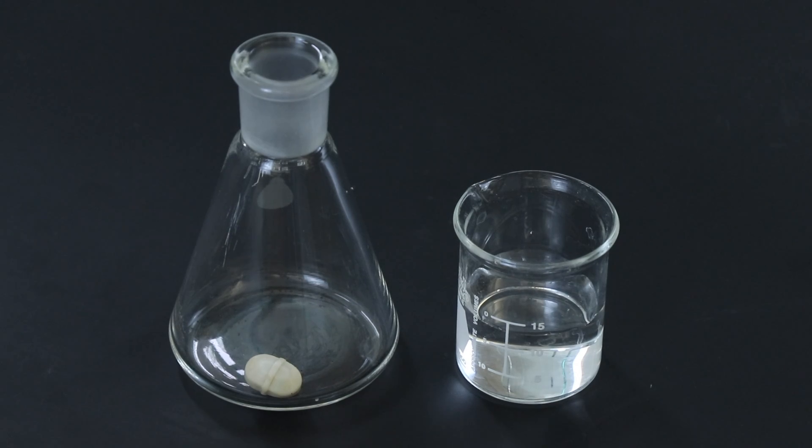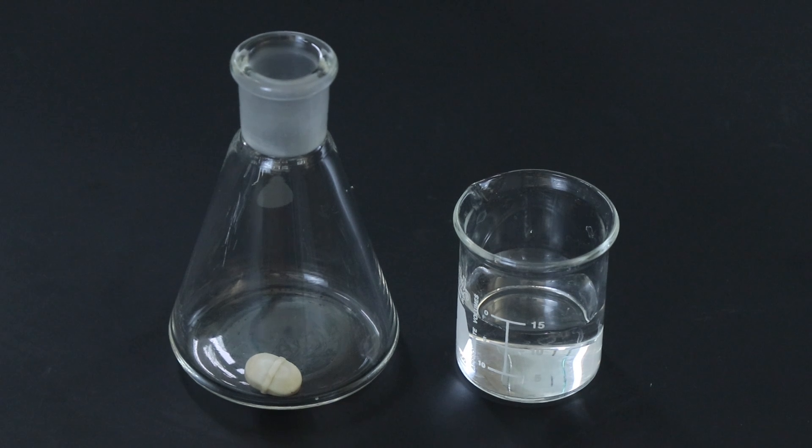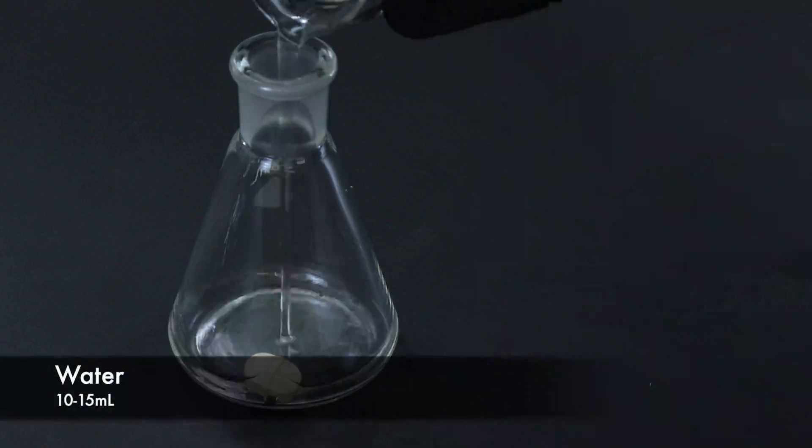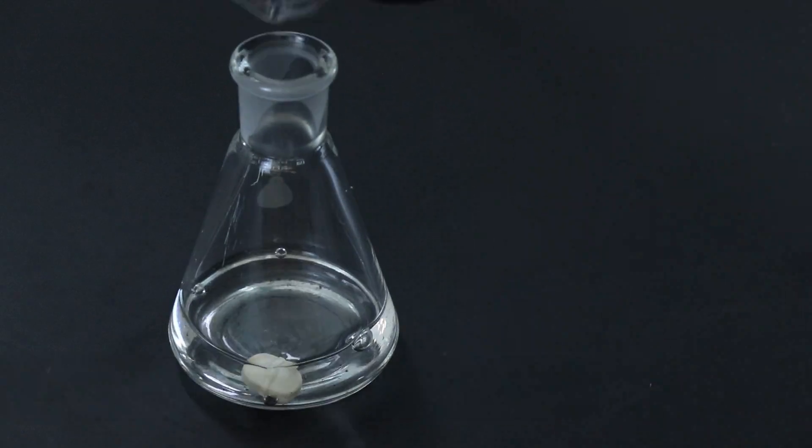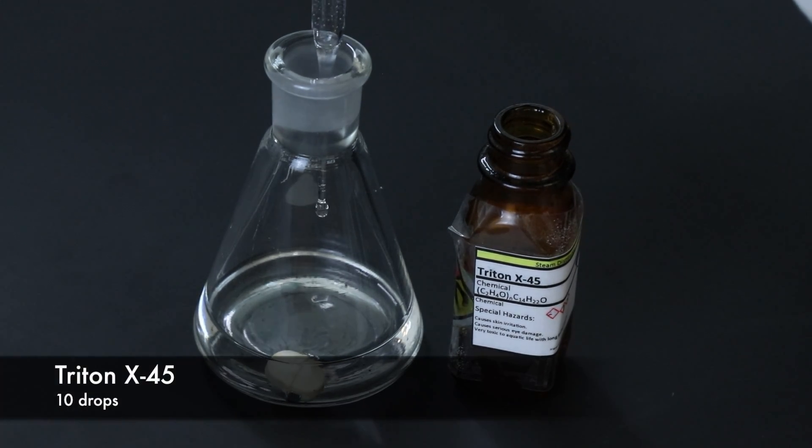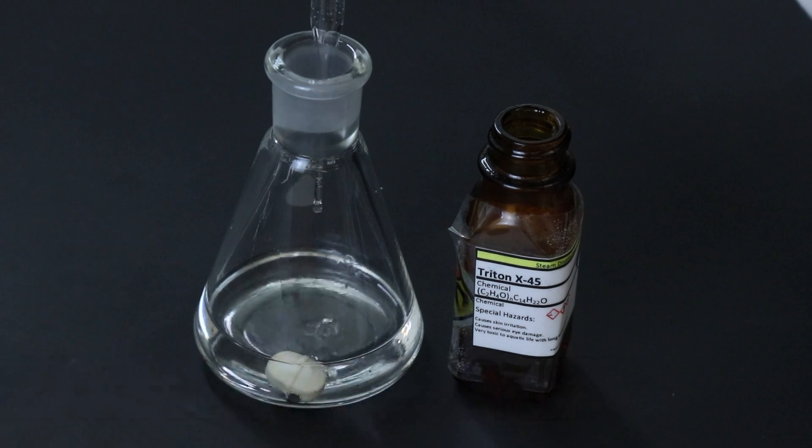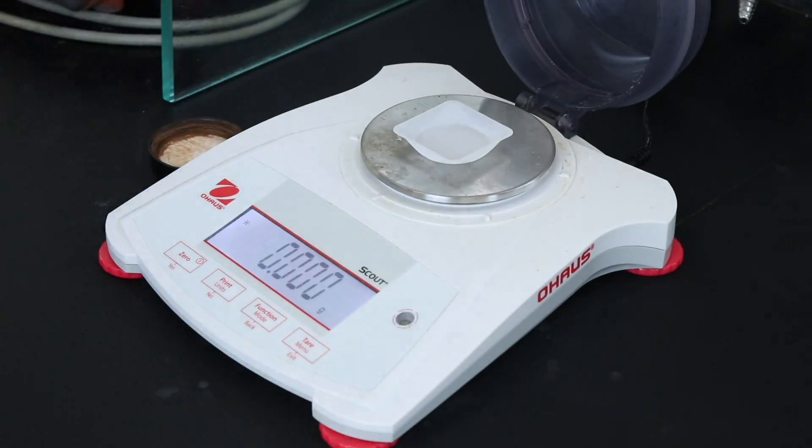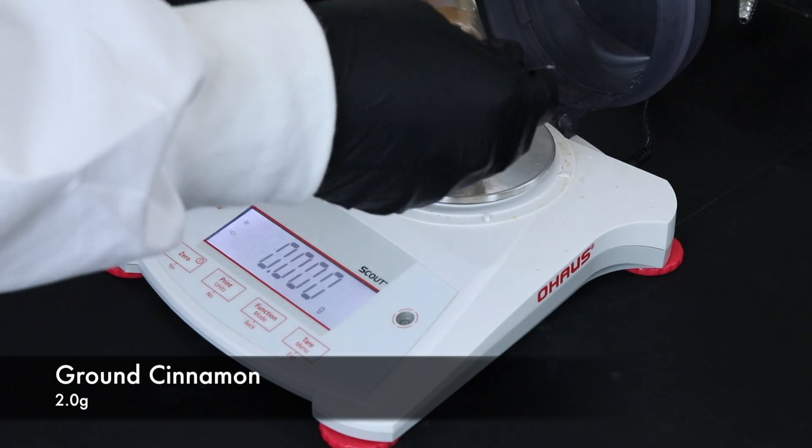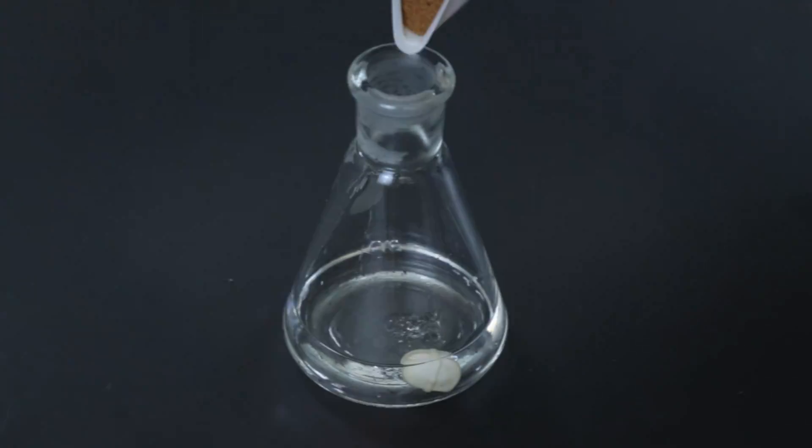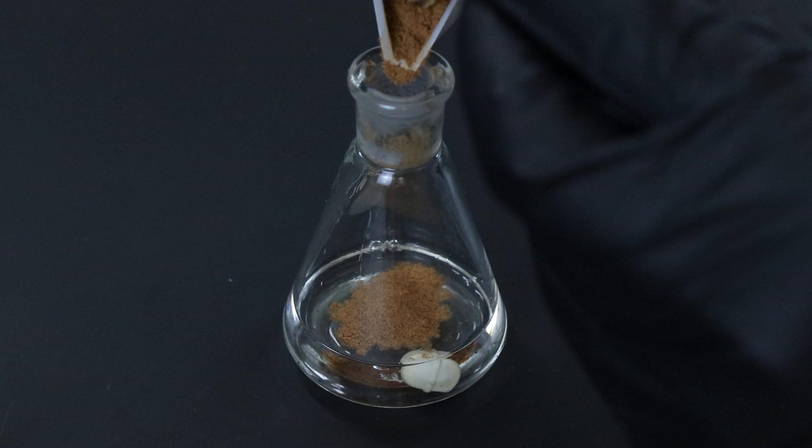Okay here is the Erlenmeyer flask rented from the stockroom. I've already placed a spin bar inside so now I'll add between 10 and 15 milliliters of water. Then I'll add 10 drops of the Triton X-45, doing all of this before adding the cinnamon because adding the cinnamon last can help keep it from burning on the bottom of the flask initially. Now I'll weigh out about two grams of the ground cinnamon, noting exactly how much is weighed so a percent recovery can later be calculated, and I'll just add that on top of the water in the flask.